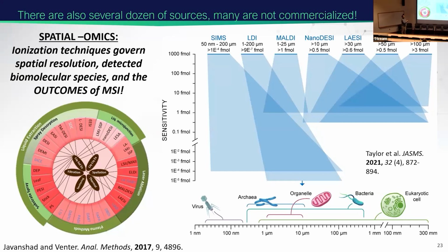Not only can we do laser desorption ionization, which allows us to profile a lot of the diverse chemical compounds from soils directly intact, very akin to atmospheric pressure photoionization or APCI, which is chemical ionization, but we can also do matrix-assisted laser desorption ionization. We've talked a lot about MALDI.